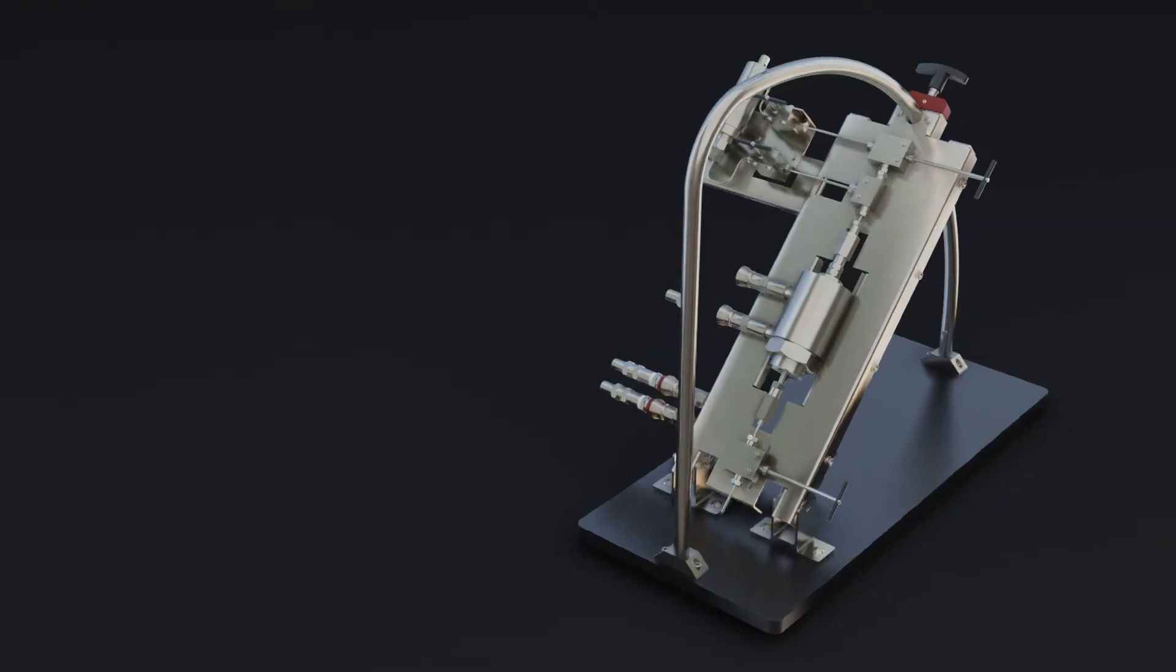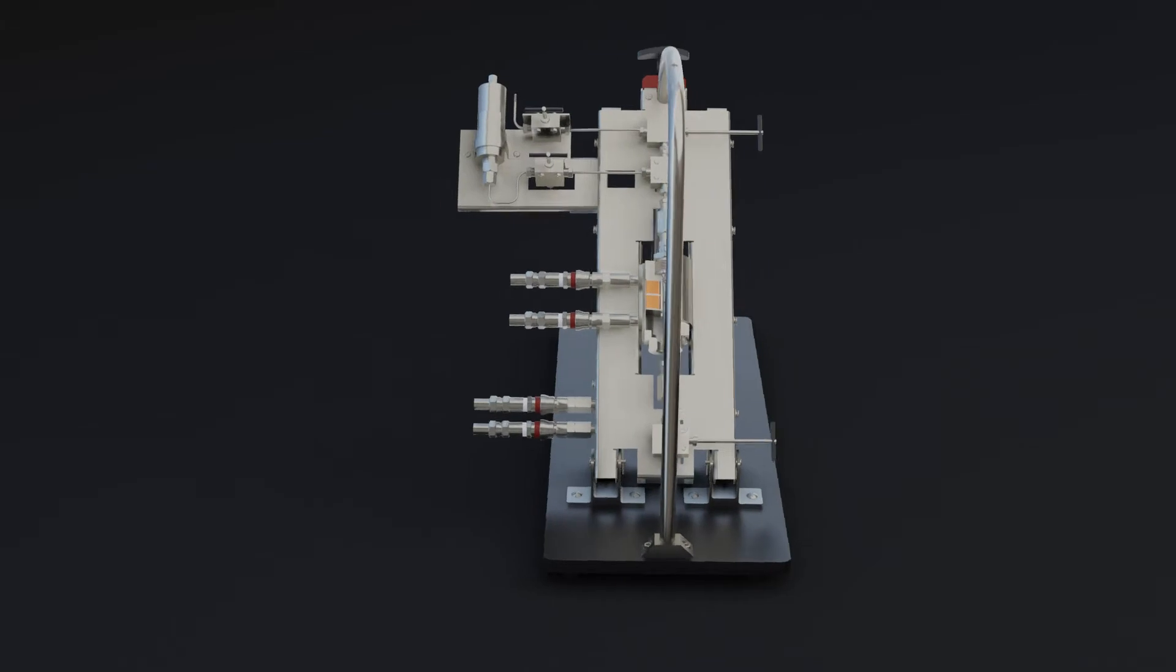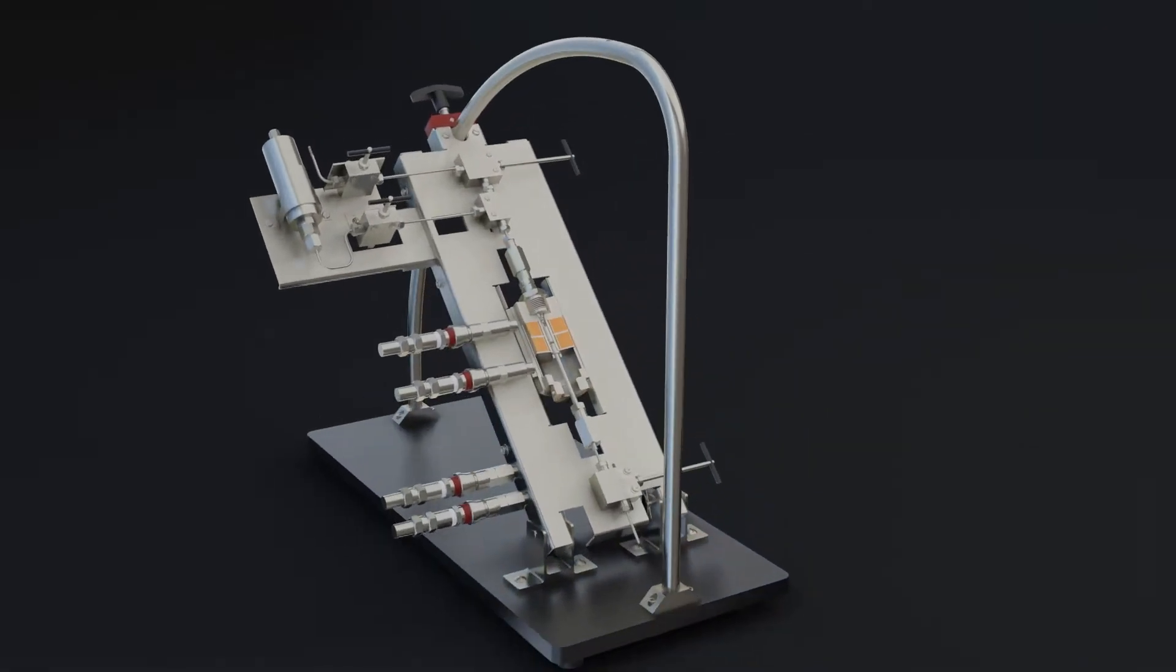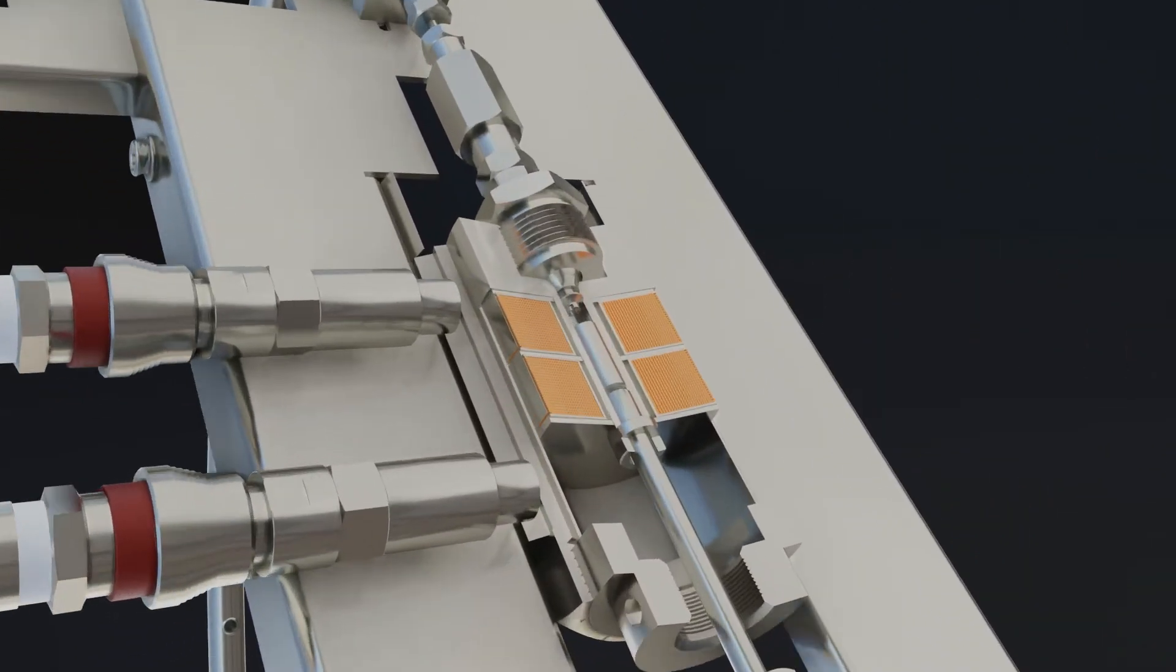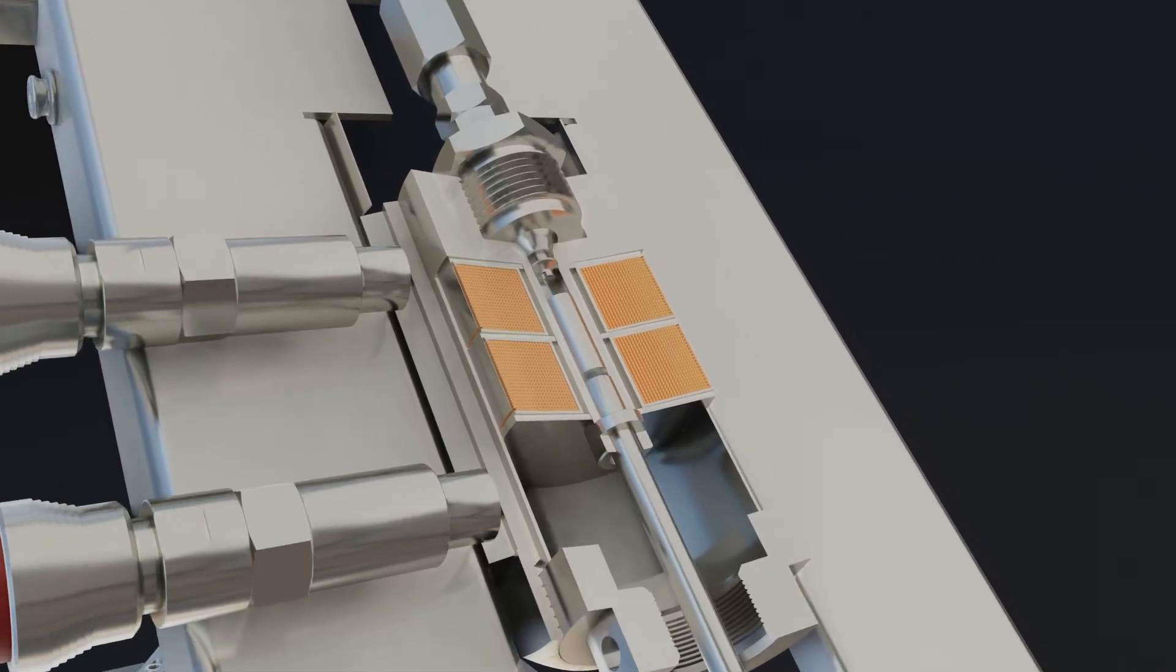Viscosity ranges are 50 to 1, allowing Cambridge Viscosity to expand the measurement range and reduce the frequency of piston changes over typical PVT instruments.